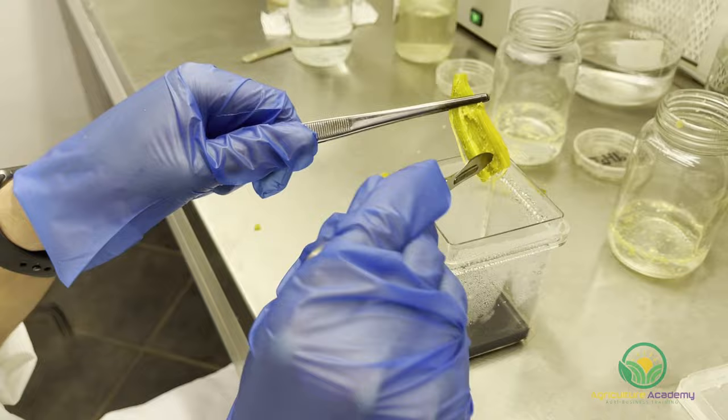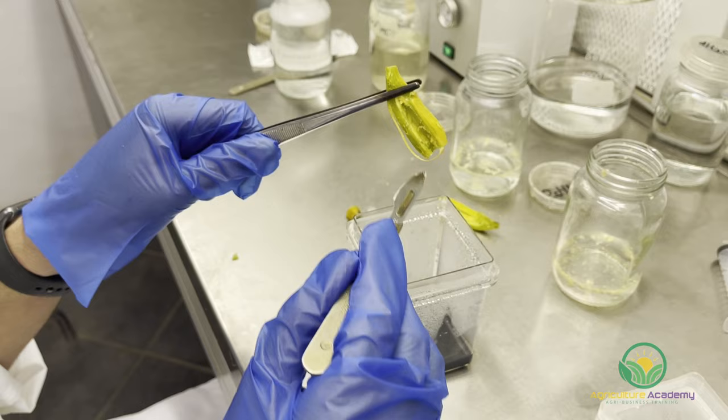Dry seed flasking is a bit less finicky than the next method and great for beginner orchid flaskers. However, you do risk overcrowding your seed, which means your young seedlings will need to be transplanted and divided much sooner.